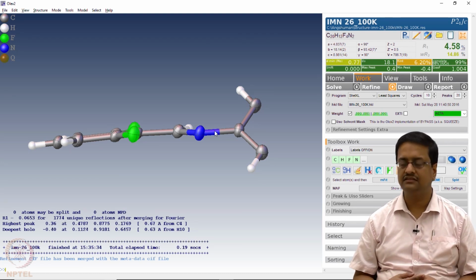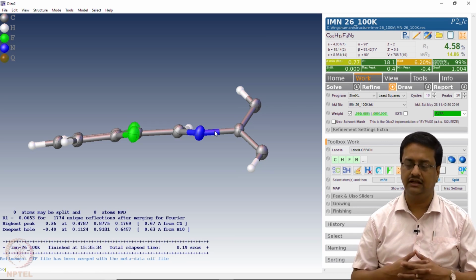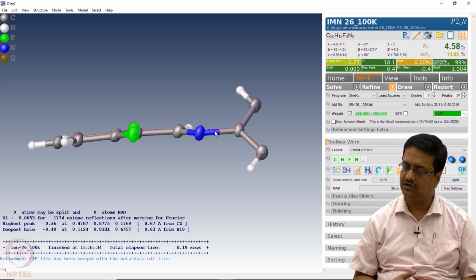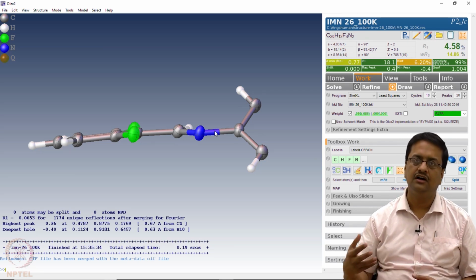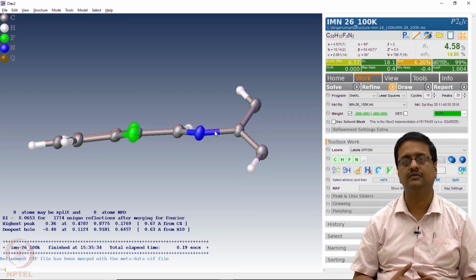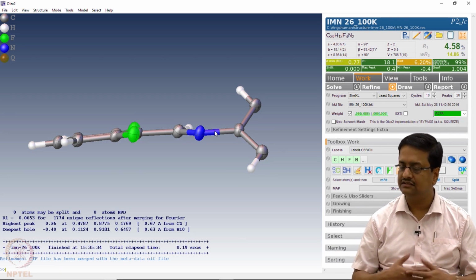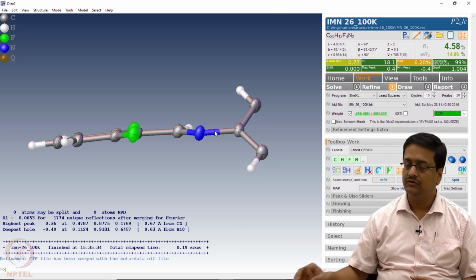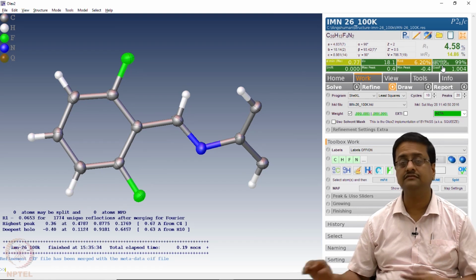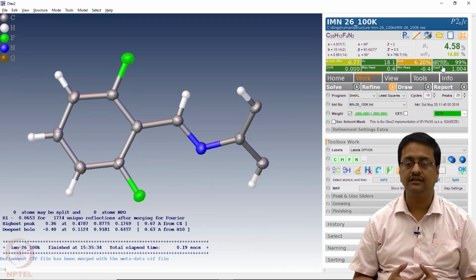In the next couple of lectures, we will be going through an instrumental demonstration, how the crystal is mounted and things like that, and then we will have a complete discussion using OLEX2 on how structure solution and refinement is done, and also we will discuss disorder in a molecule. So we conclude today's lecture with the note that we must look at structural parameters at the end and make sure that all of them are green and nothing is glowing red.